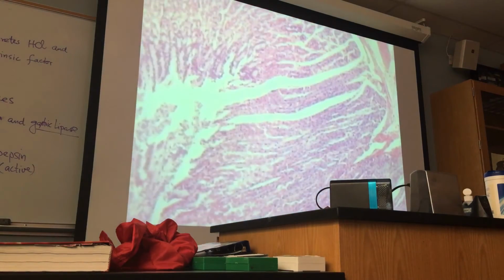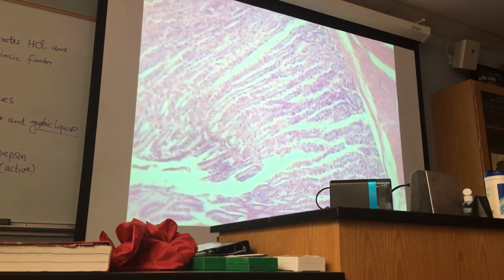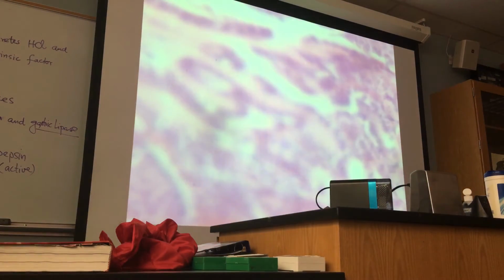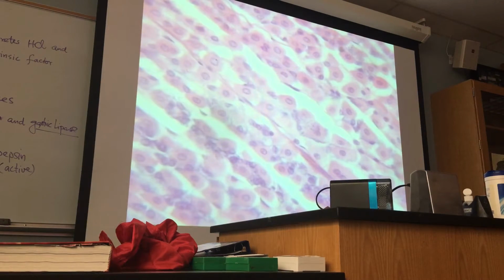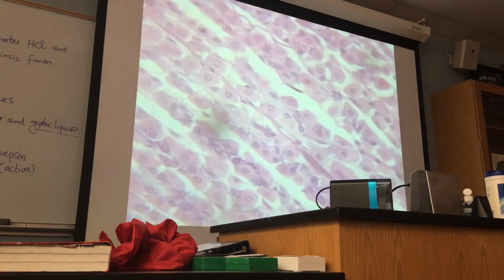We go to the best region, best part. Okay. Next magnification. There you go. Fantastic. And let me play with the light a little bit.